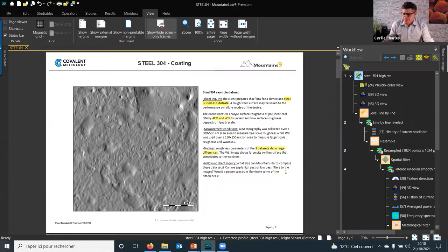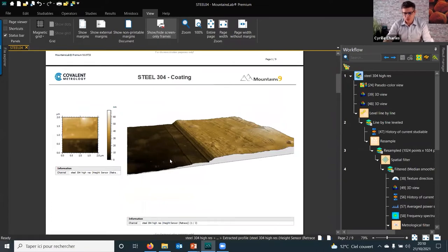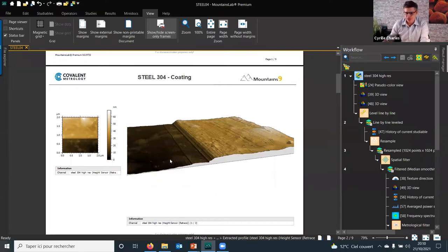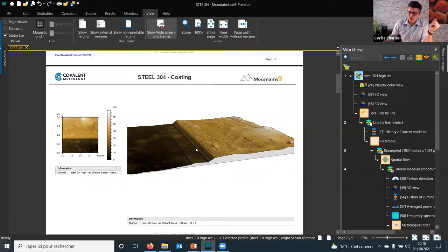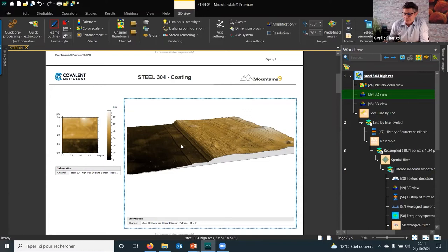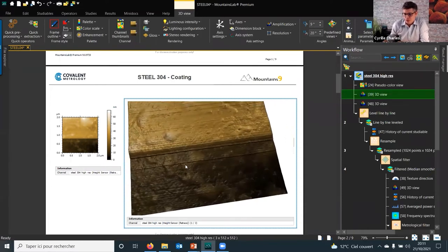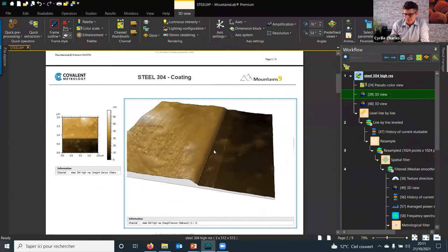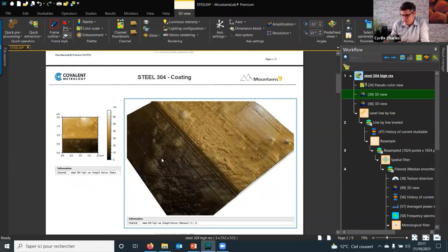On the second page, this is a raw dataset coming from the AFM. You can recognize a surface from an AFM because we use this kind of brown color to display it. You can see light brown and dark brown — there is a kind of step because the color itself is related to height. Here you can see a 3D view of the surface with a step, and the document is dynamic — if I click on the 3D I can move it and see more details, still in one brown color.